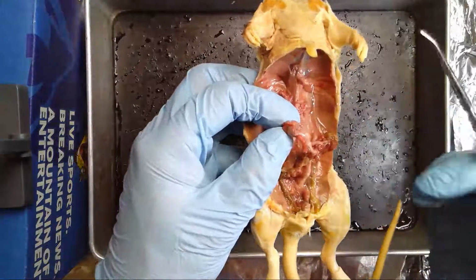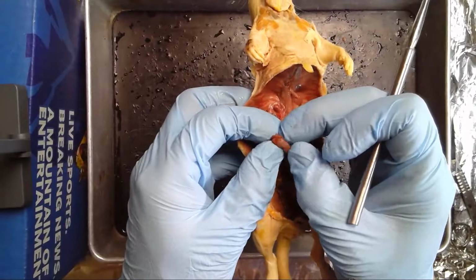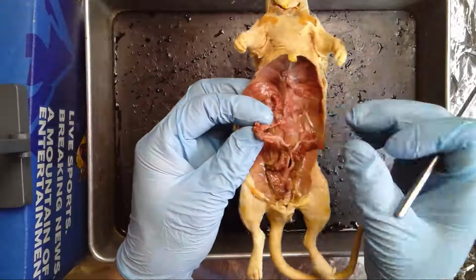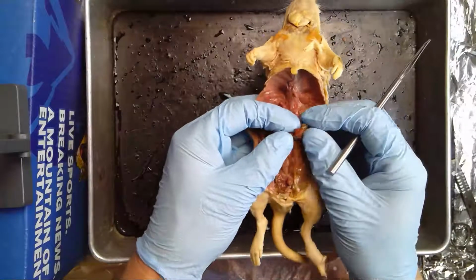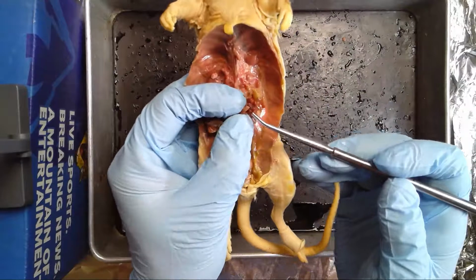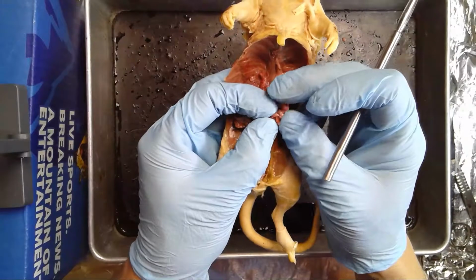Let me bring this up closer to the camera. So that's an ovary, and you can actually feel it's quite hard or dense, I guess, and it has kind of a granular appearance. Let's look at the other side. You can see at the end of this uterine horn, again, here's the ovary. So it's got almost kind of a grainy appearance.